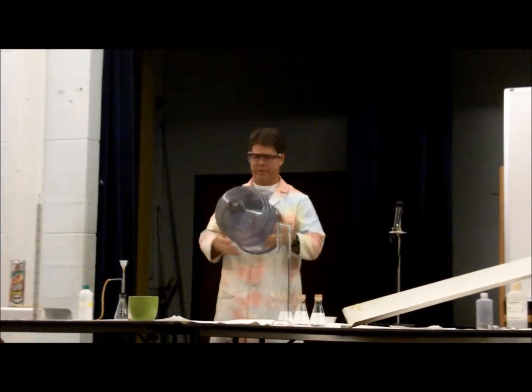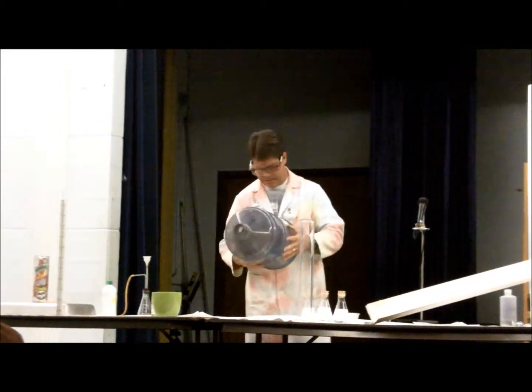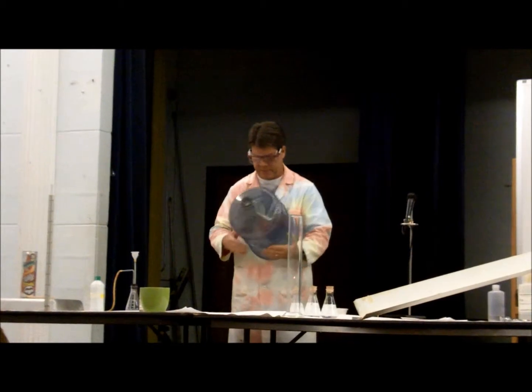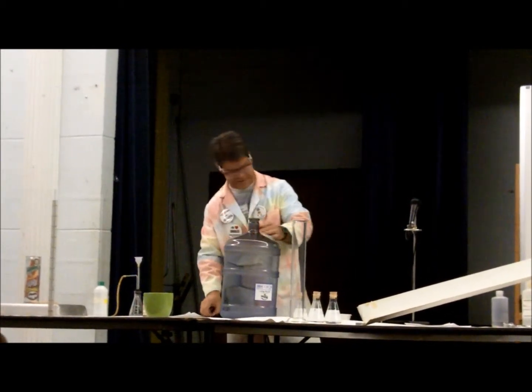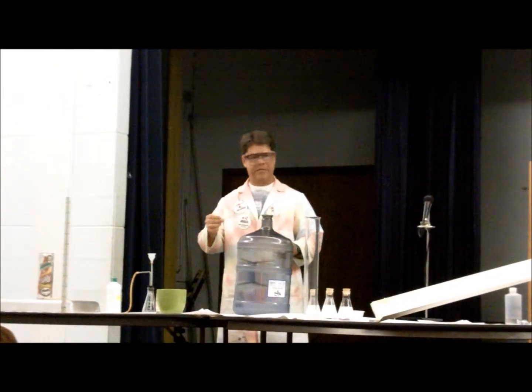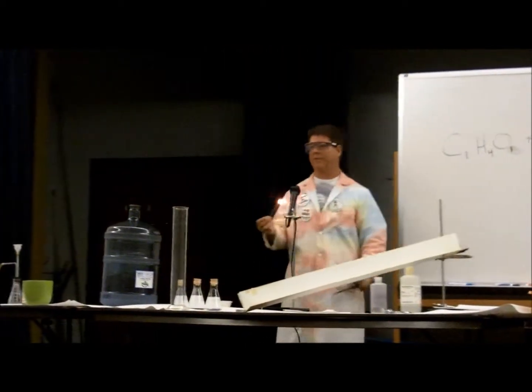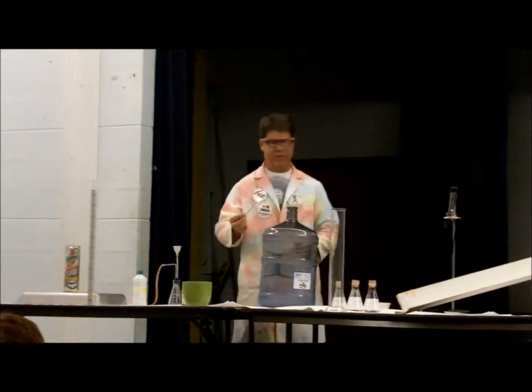Methanol is one of the more flammable types of alcohol. They often call it wood alcohol. The reason why they call it wood alcohol, I believe, went back to the days of moonshining, when they made their batches incorrectly and would get the wood alcohol, and they said it would make them go blind. All right, so now we've got our oxygen inside of there. We've got our methanol, so now we should have combustion. Okay, and this is called a whoosh bottle. It will make a loud whoosh, but it will not make a loud pop.